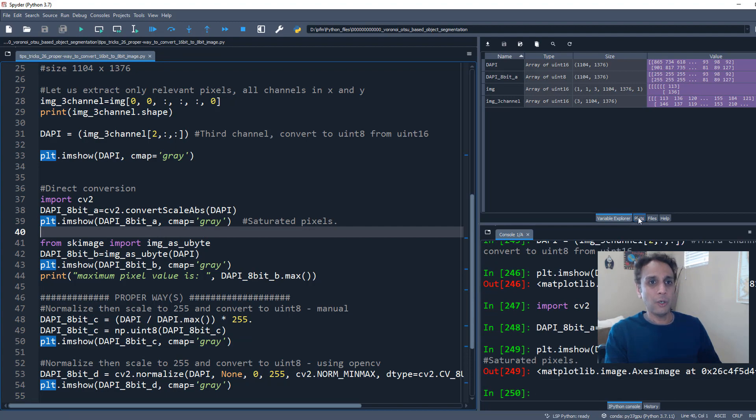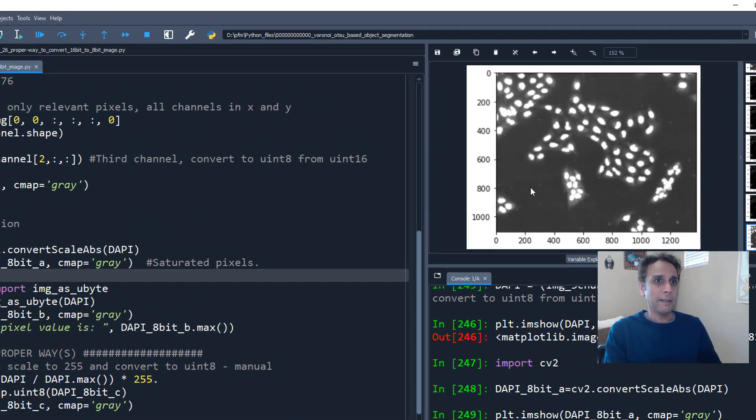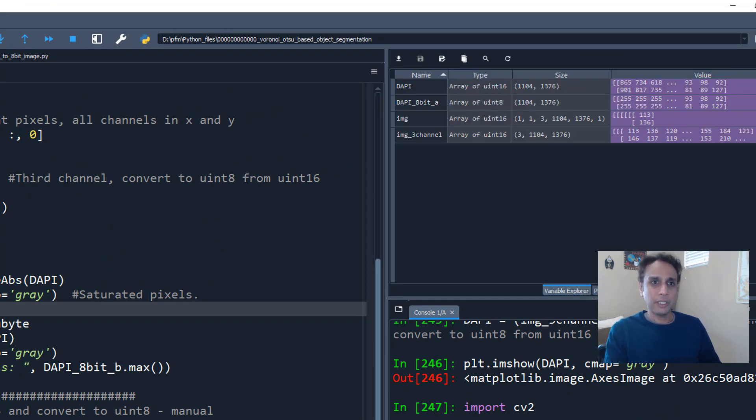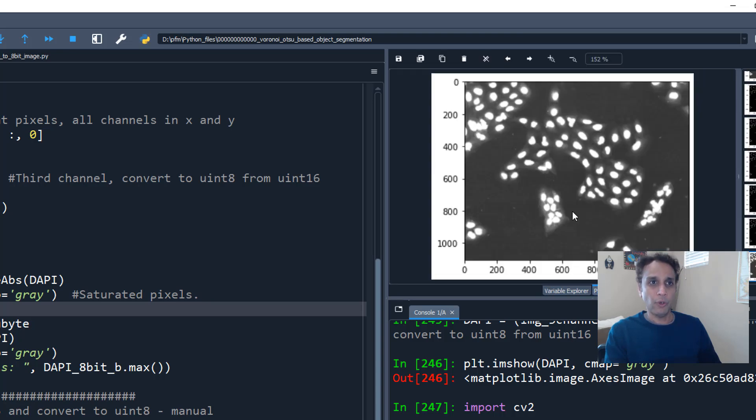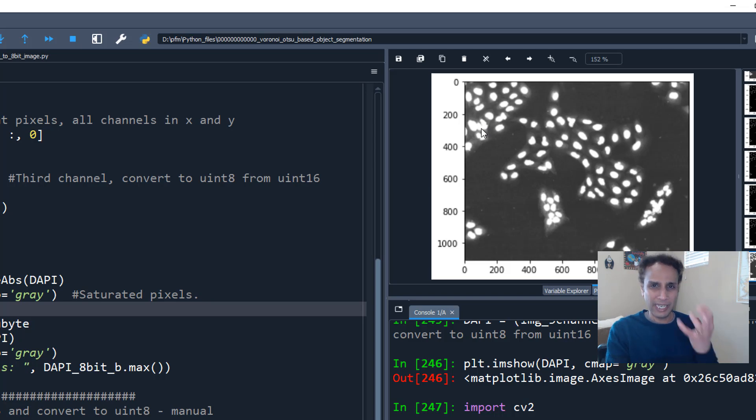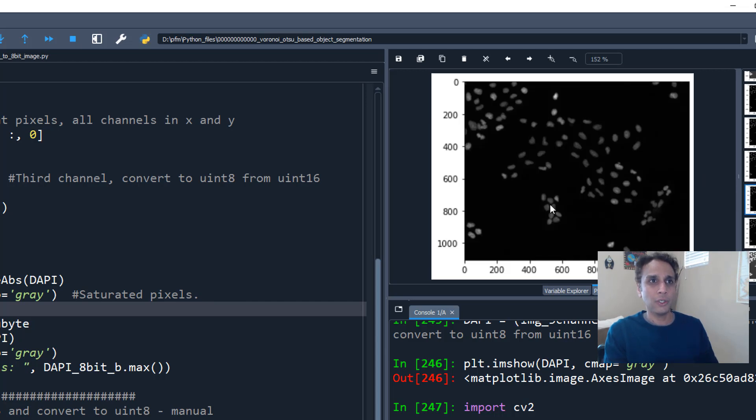Because when you do that, it's going to rescale it. But when you plot it, you see how horrible this image looks like. All it's doing is it's actually saturating all these pixels. Of course, it did convert that into 8-bit, unsigned 8-bit. But this is not what we want. You are losing all the features that you have within these nuclei. And they are all completely saturated.